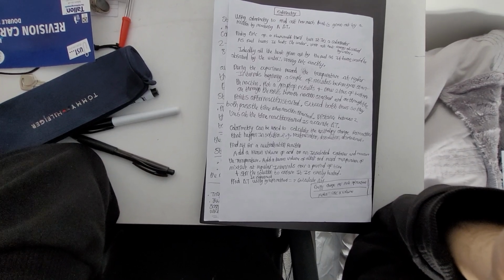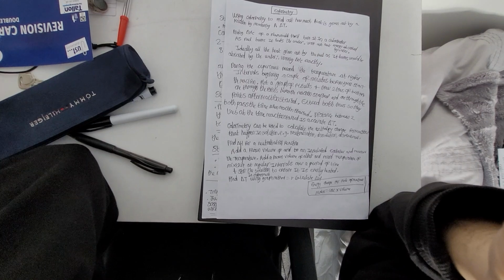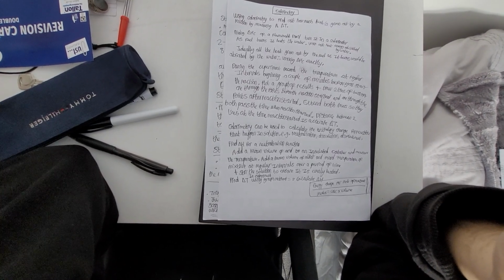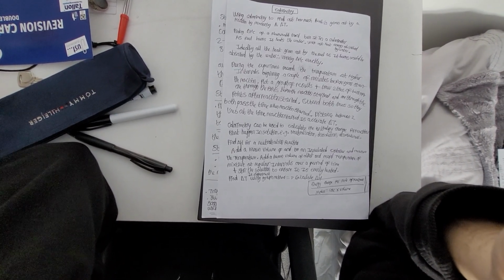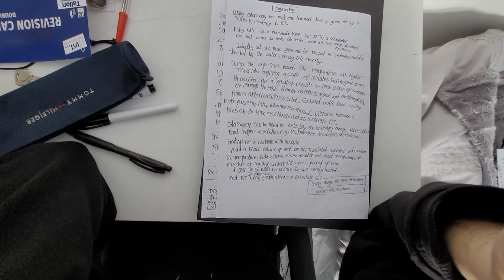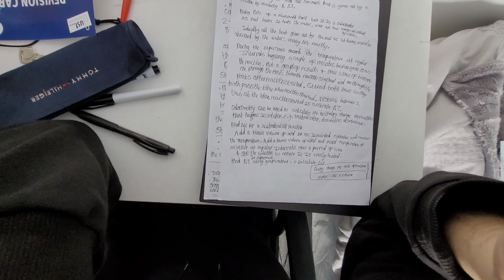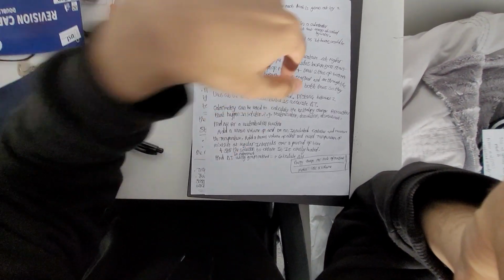Now, finding the enthalpy for a neutralization reaction, we add a known volume of acid to an insulated container and measure the initial temperature. Add a known volume of alkali and record the temperature of the mixture at regular intervals over a period of time. Then stir the solution to ensure it is evenly heated, and then find the temperature change in the experiment using the graph method. And we can calculate enthalpy change.